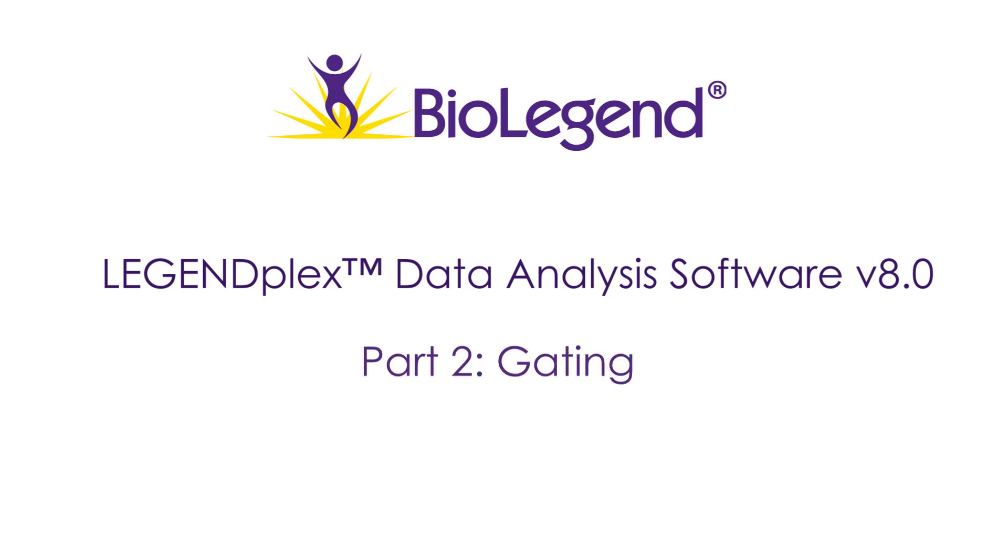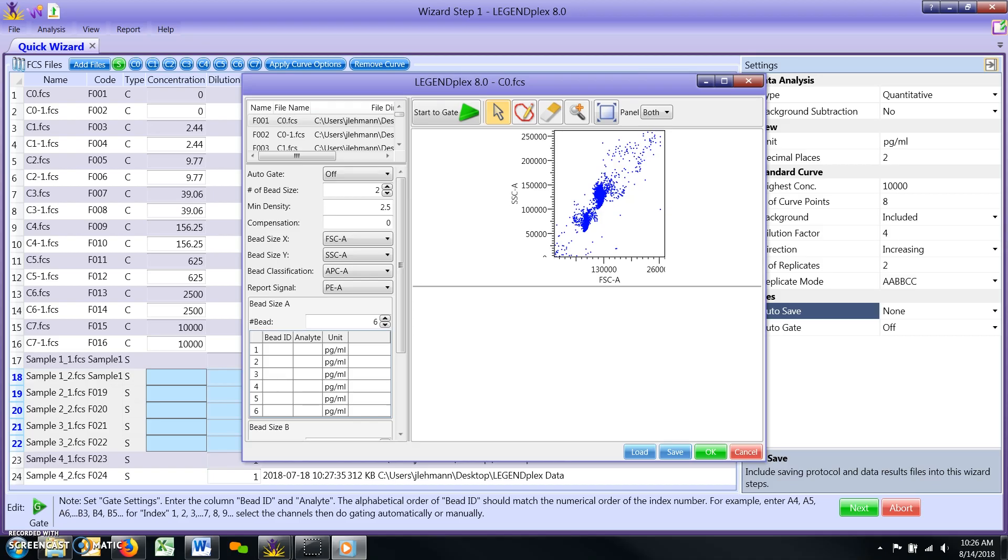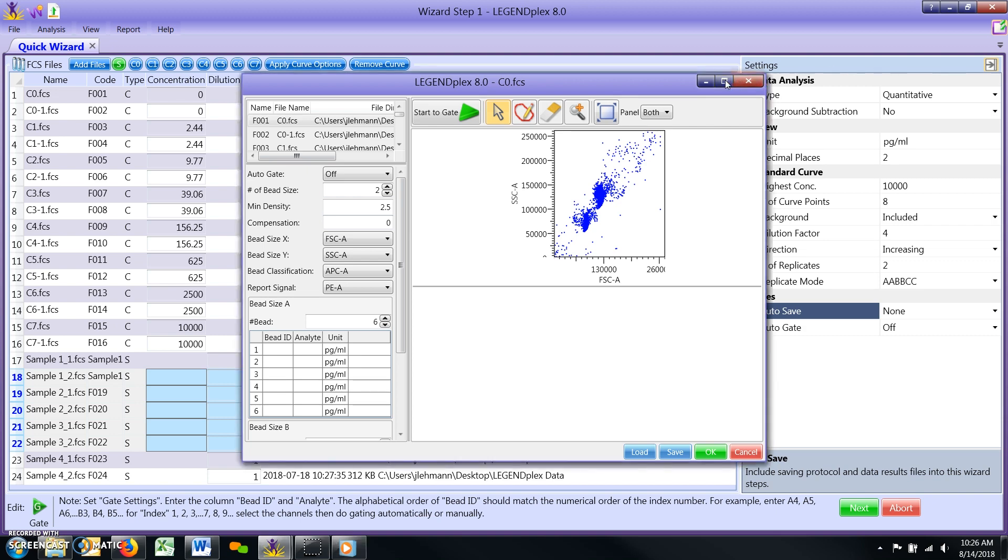The gating window is used to define the acquisition parameters from your flow cytometer, the analyte targets in your assay, and a global gating strategy for your samples. We recommend maximizing this window in order to have the best view of all settings and options.